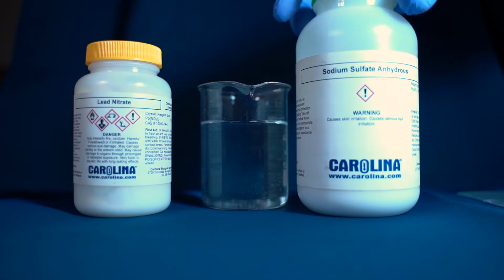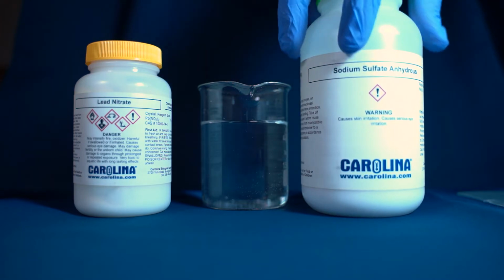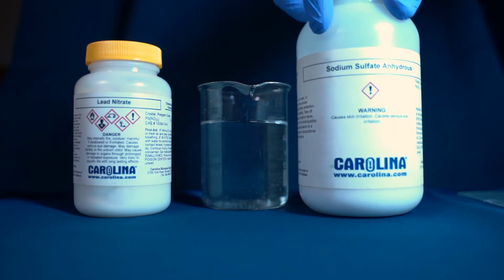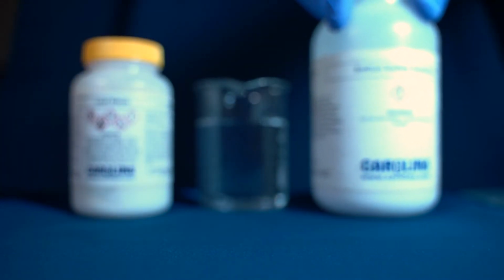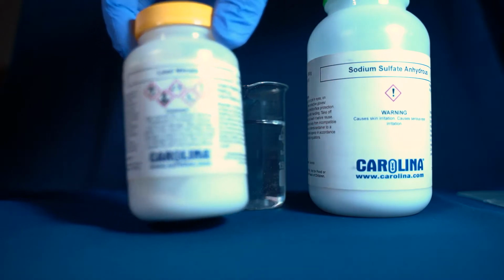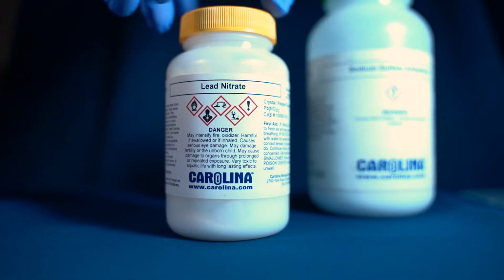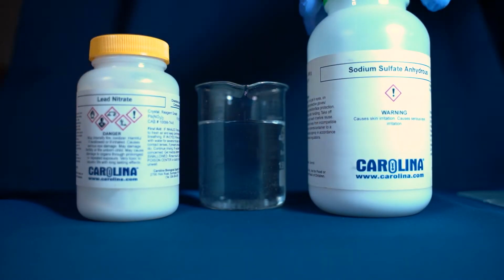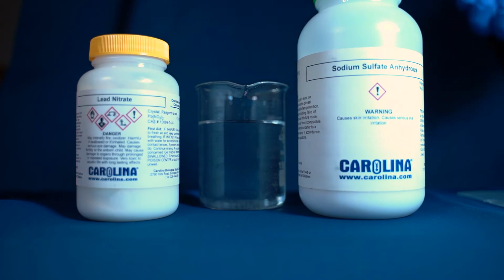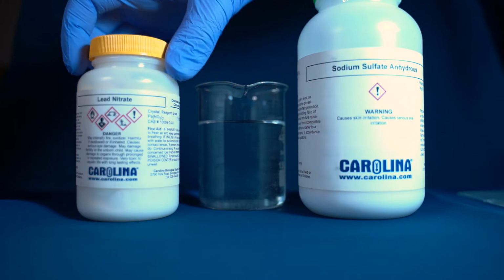So what I'm going to do is make a solution of sodium sulfate, which is this one, and lead nitrate, which is this one. And when I combine those two solutions, we're going to create a precipitate, and we're going to find out what our precipitate is. So first I have to make these solutions.